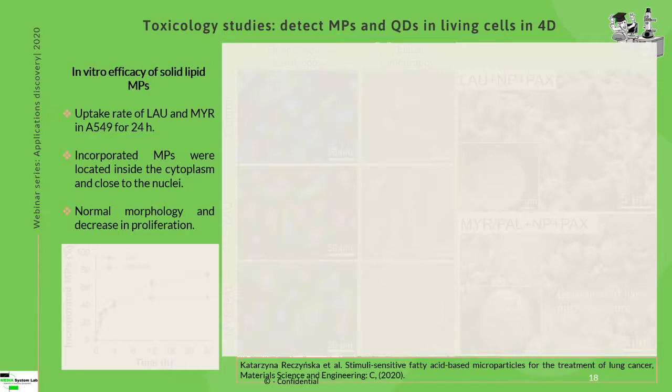But if you check the optical tomography, it's clear that the control is almost without accumulation of lipid inside, while the other cells are going to make the engulfment of this lipid in the central part of the cell around the nucleus and in the cytoplasm, while the morphology remains completely the same. So they have exactly the same morphology of the control, but with the accumulation of fatty acid in the central part of the cell that is definitely an expression of the uptake of those.